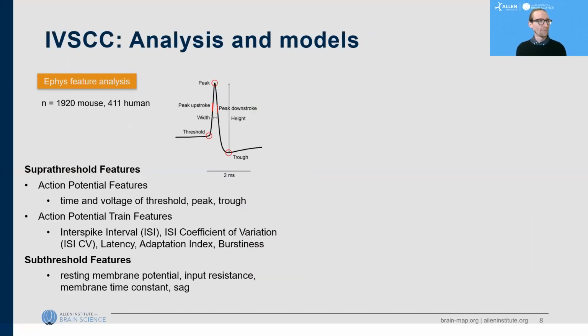So for the first set of stimuli, the feature generation ones, the step following recording is to take those recordings, the data, and run some analysis packages to extract features that summarize the distinctive characteristics of each cell's response. So there's several categories of features we use.